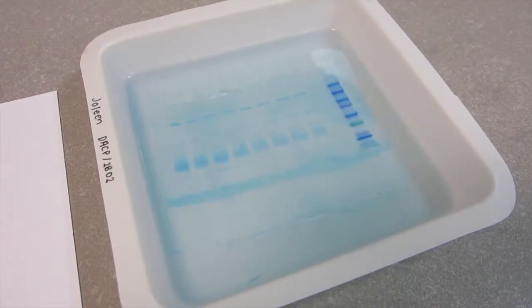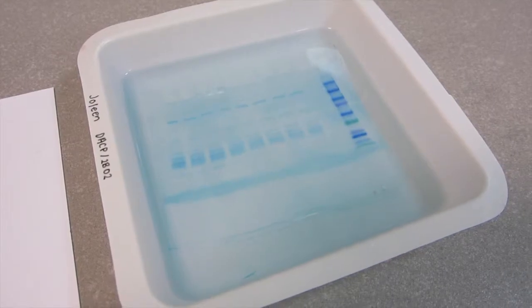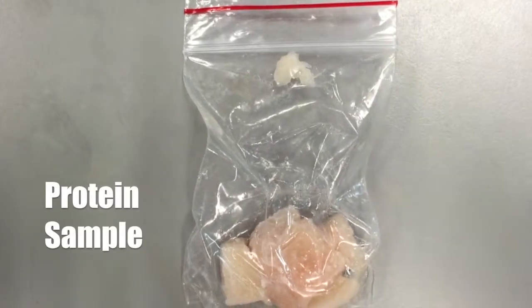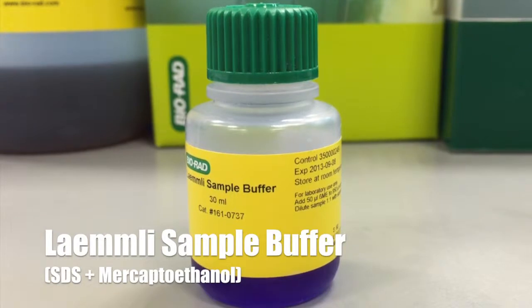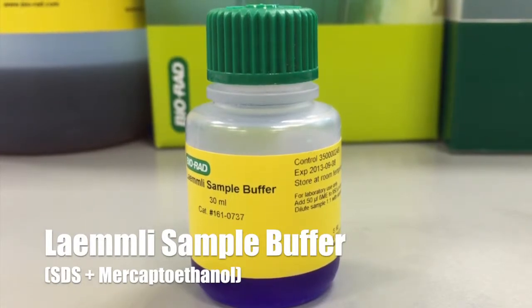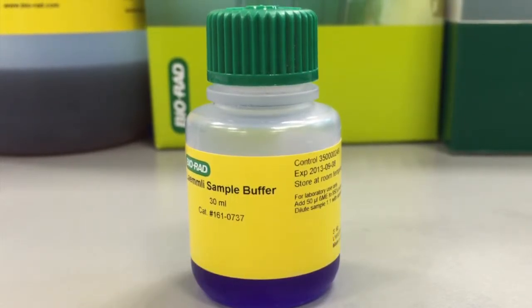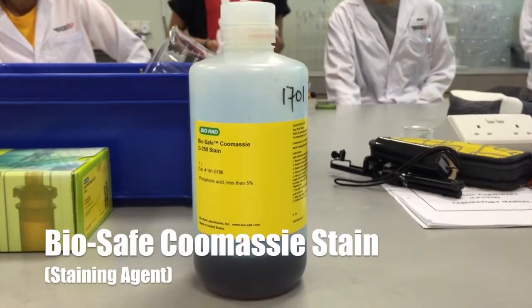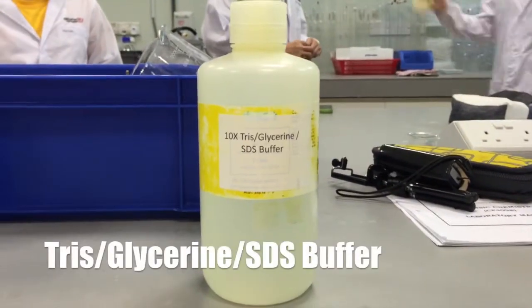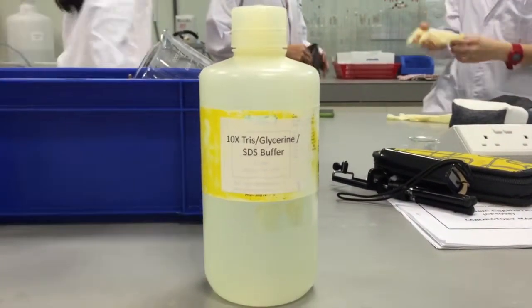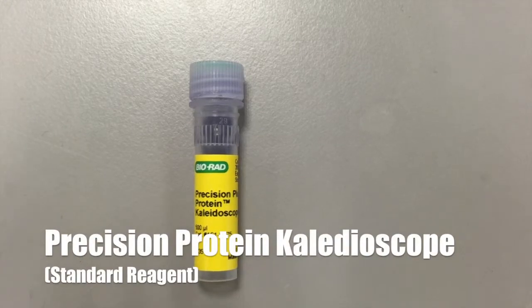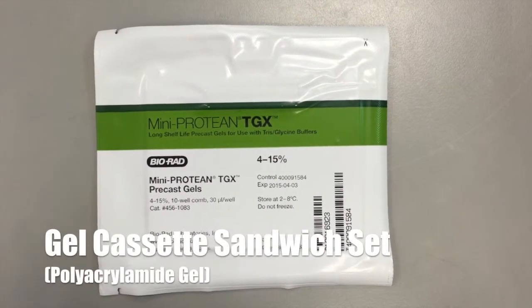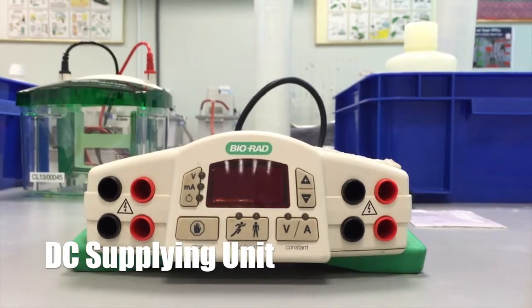We will require the following equipment and reagents: the protein sample, the Laemmli sample buffer containing SDS and beta-mercaptoethanol, Bio-Safe Coomassie stain, tris-glycine SDS buffer, the protein standard, ready-gel cassette, and the electrophoresis unit.